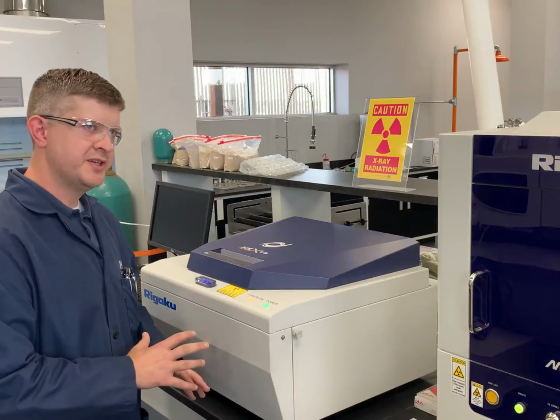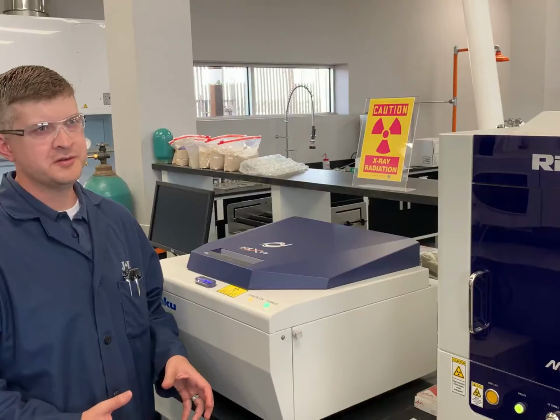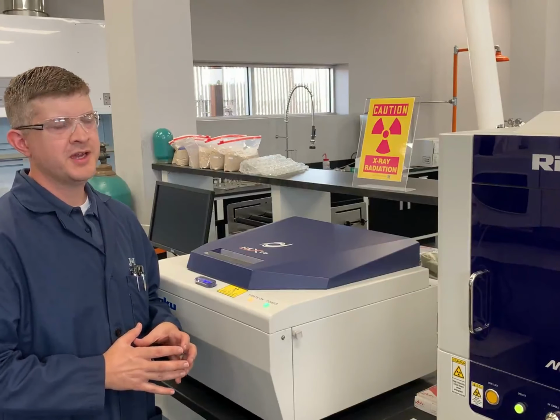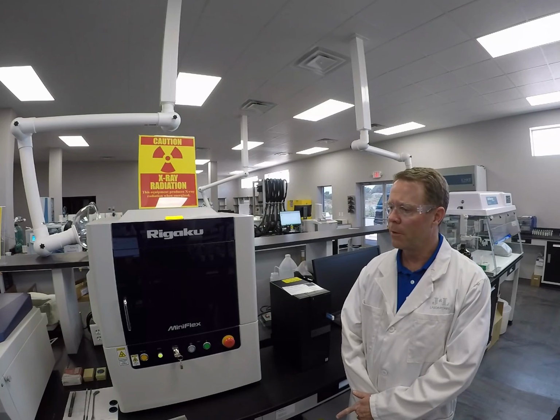But the XRF has limitations in that it's only going to be scanning the cations. So we have to use some wet chemistry along with the XRF data to have an idea of what the molecule is. And then to nail it down, that's where the XRD comes into play. Before you go on, tell me, what does XRF stand for and how does it work?